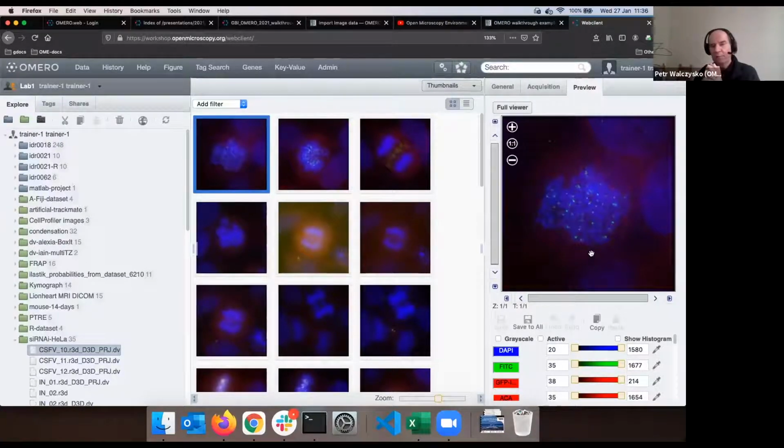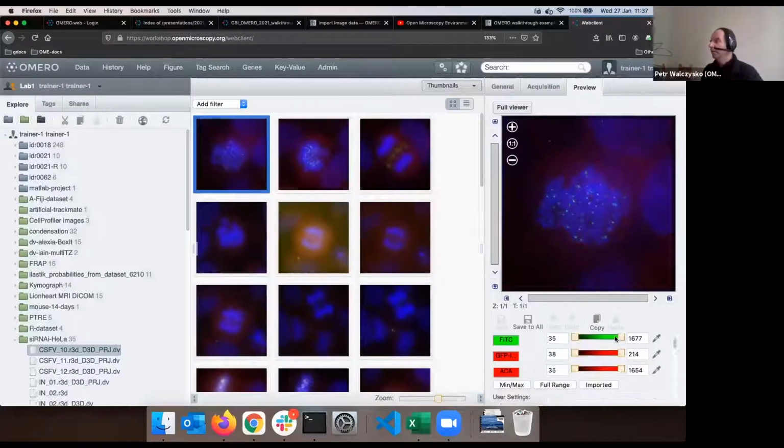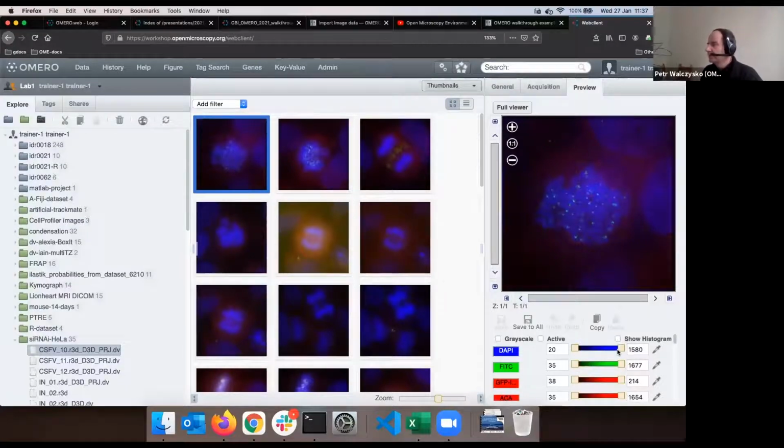And any time you would like to grab it, it's there for you. You can download it and have it back in exactly the same way you imported it. But these rendering settings are very useful, and you can think about them as a pair of goggles which you are using to view the world.